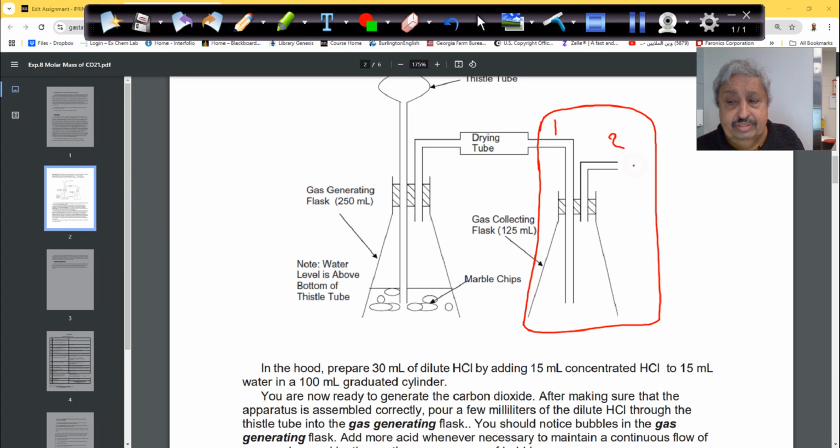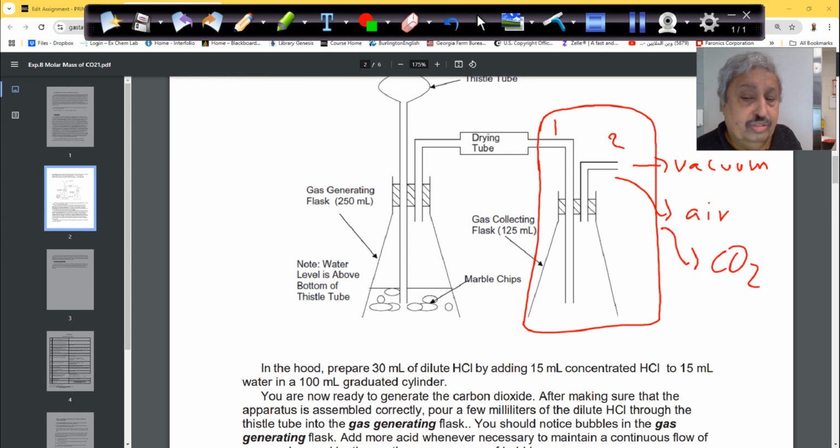Go in all the way. This is going out. You can use this one here for the vacuum itself, or you can use this one here when you heat it up a little bit to vacuum. Use it for the vacuum, or just keep it so the CO2 will go out, the air will go out. Okay, guys, those are the two tubings. This one here, up to here. Of course, this is the lid here. Up to here is tubing one, and up to here, the second tubing.